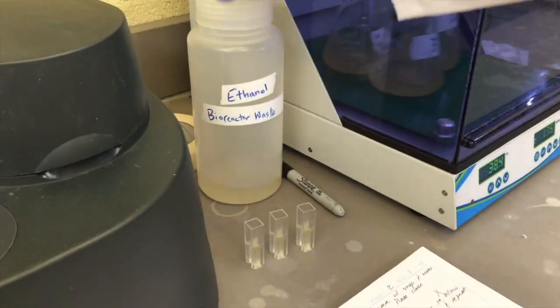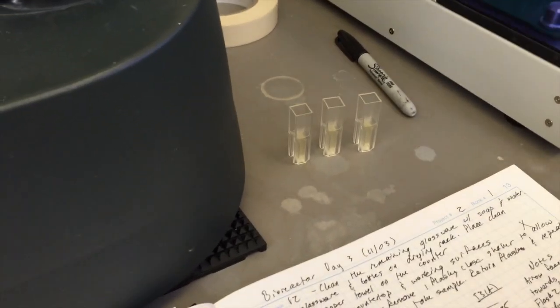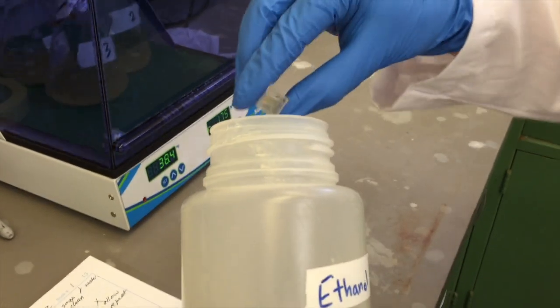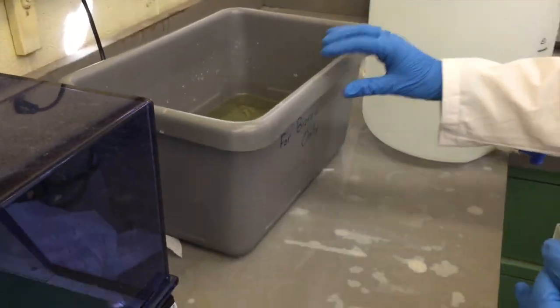Dispose of cell cultures in an ethanol waste container. When the reaction is completed, add bleach to the reactor vessel and sterilize for 30 minutes before disposal. After disposing of biologically active material, place used glassware and containers in a wash basin of bleach solution.